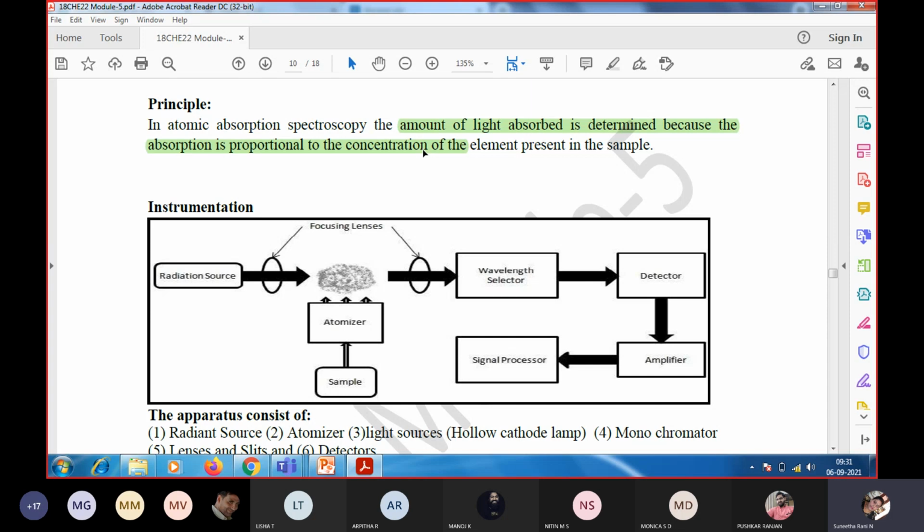How much light the solution you have prepared absorbs is what we are measuring. It will not emit any light radiations; you are measuring only what is detected at the atomic level.